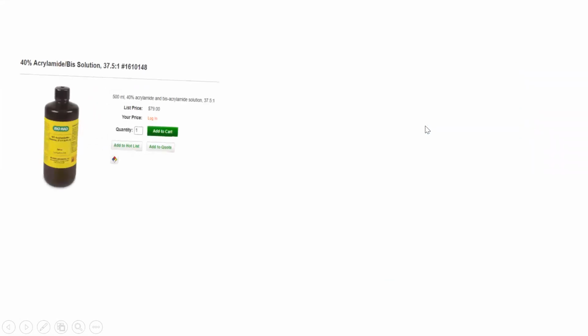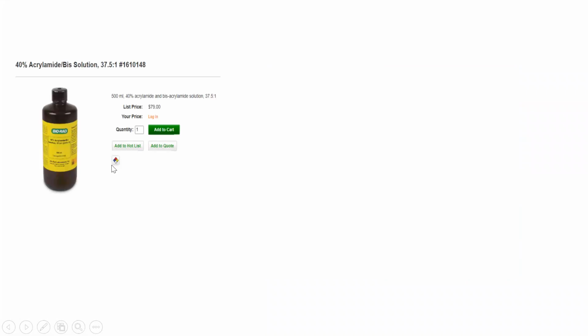And the next, I have checked the price. Yeah, the price is very important for our lab because we have to calculate and cost low and produce more. So the first thing we have was the 40% one. I just short to call it AB buffer. There was one bottle, and it will cost $79, one bottle. That was 500 milliliters.